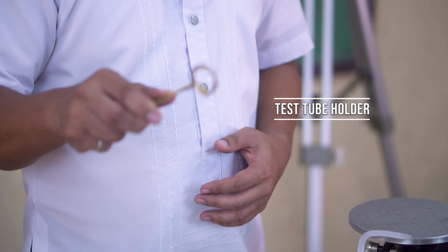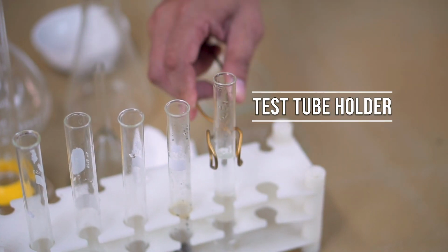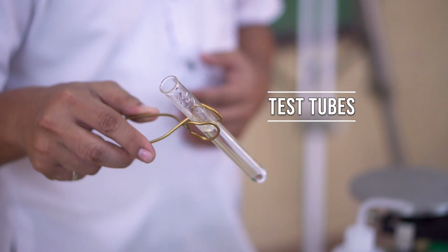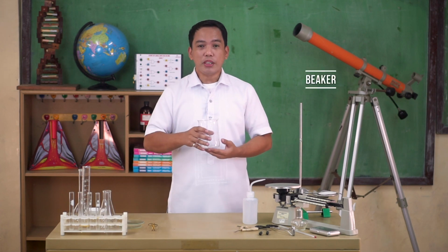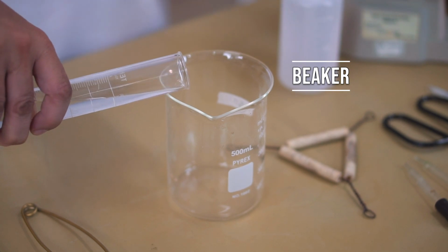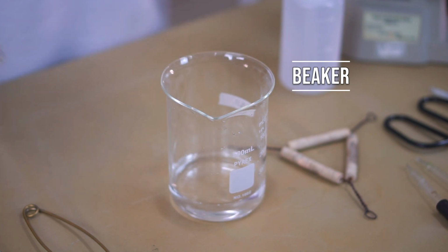Let us now discuss how each of these common laboratory apparatuses are used in conducting experiments. Test tube holders are for holding test tubes when tubes should not be touched. Test tubes are used for holding small samples or for containing small scale reactions. Beaker is useful as a reaction container or to hold liquid or solid samples. They are also used to catch liquids from titrations and filtrates from filtering operations.